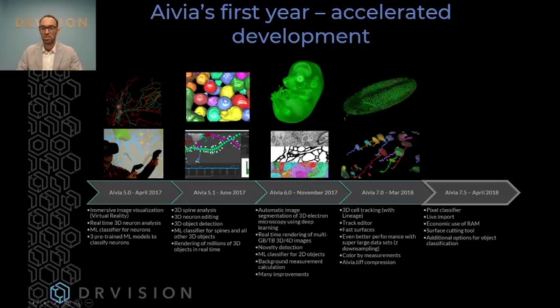And that's the picture you see on the bottom. And we also introduced a brand new volume rendering engine, state-of-the-art and capable of rendering extremely large data sets very quickly. And now we're actually using the same volume rendering for the live import that you'll see in a moment later on in this presentation.